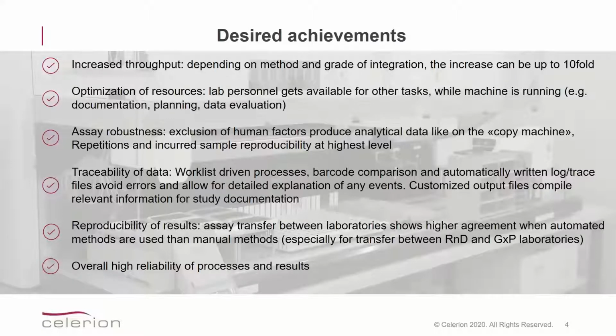Increased throughput is always the argument of managers who have to apply for the budget, and also the availability of headcount for other tasks while the robot is performing the assay workup is the most economic argument. For us, in a high salary area, these two arguments are without any doubt extremely important.